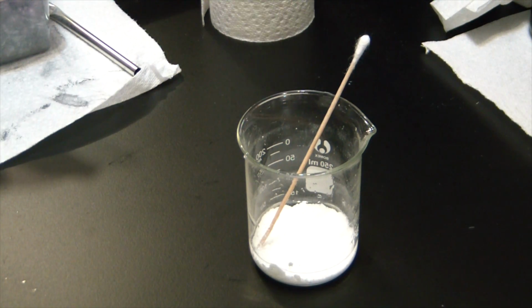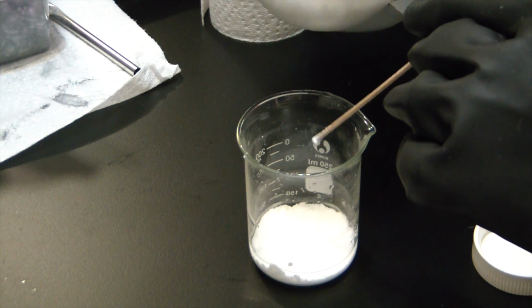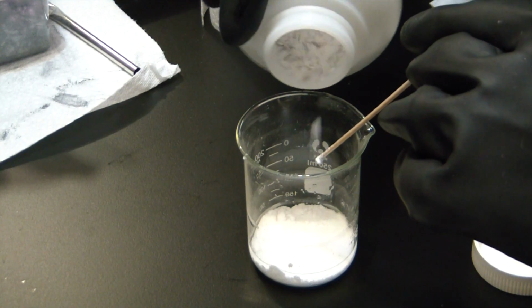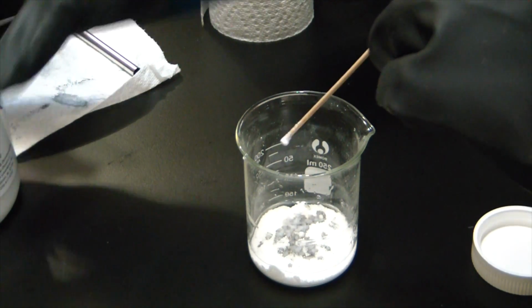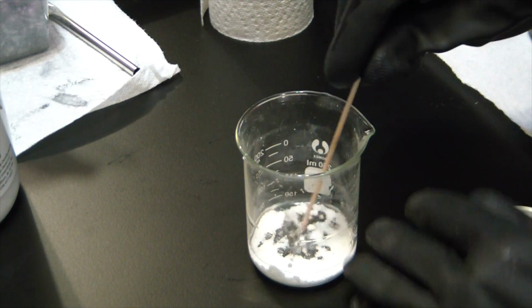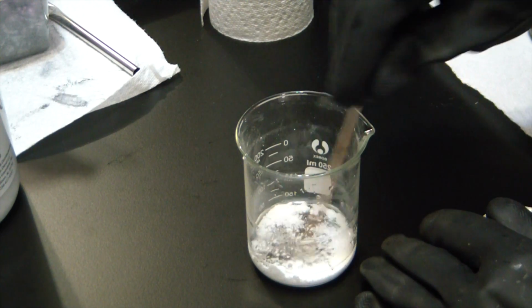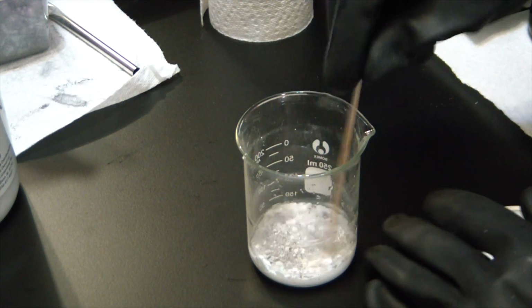And I'm going to add some potassium hydroxide. This will convert the silver chloride into silver oxide. See how it gets real dark? That's the silver oxide forming. You can actually hear the water boiling at the surface of the potassium hydroxide.